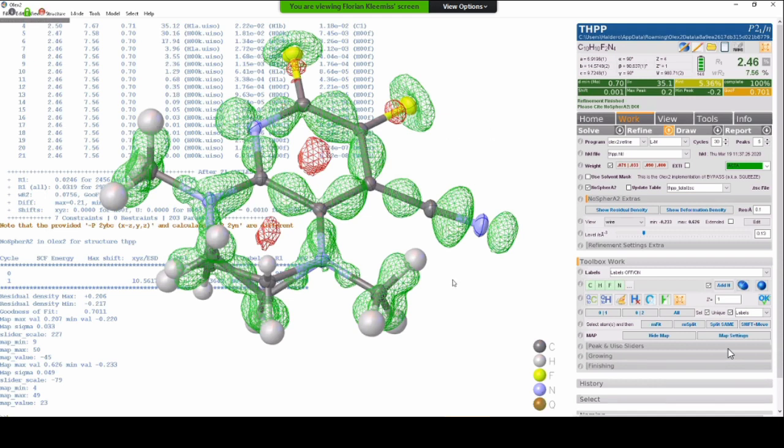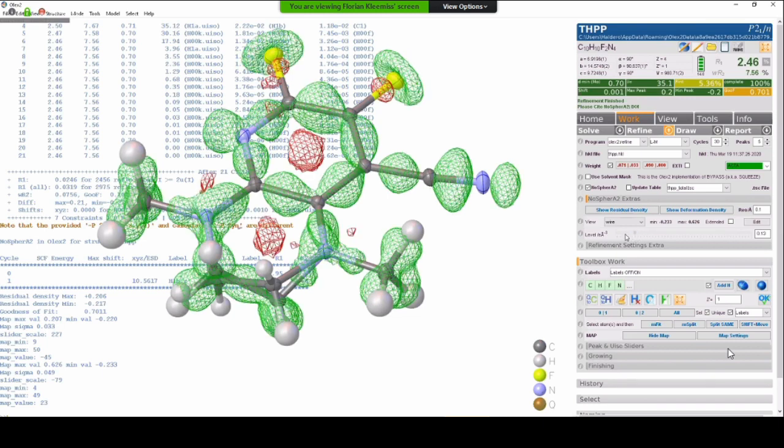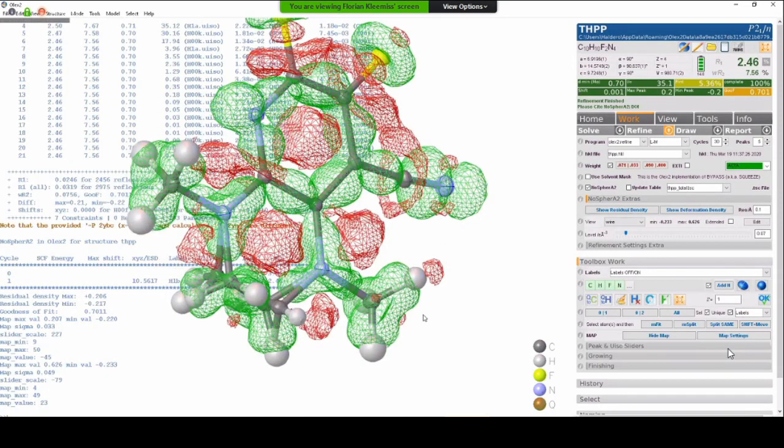And I can tell you where the biggest contribution is. It is inside the atom core. So we take away electron density from the core and describe the bonding. And this way, you can even see, if I go to higher ISO value, for example, this hydrogen atom, if I would describe it spherically, it would have a sphere of density around its position.